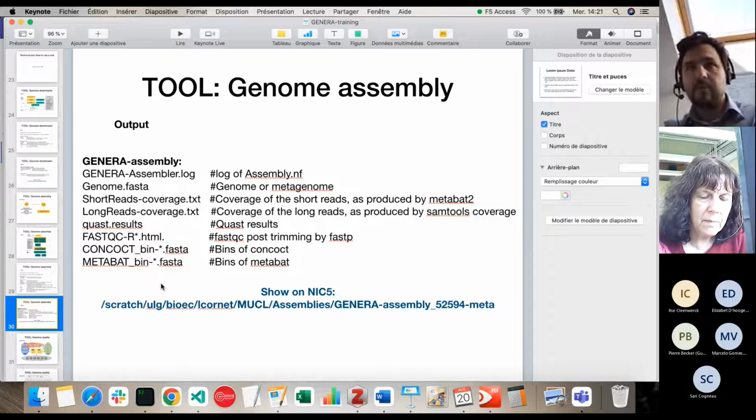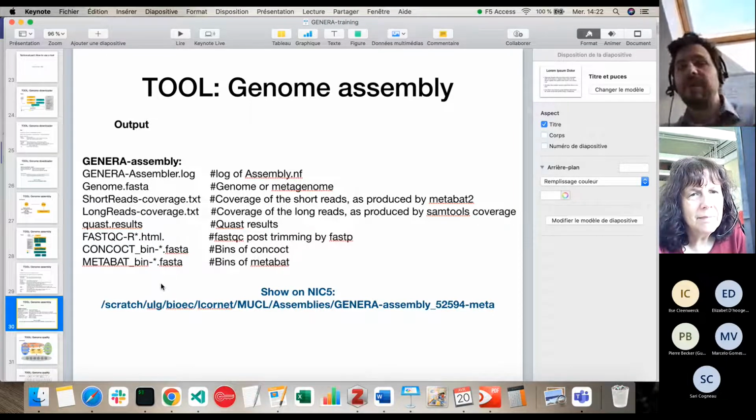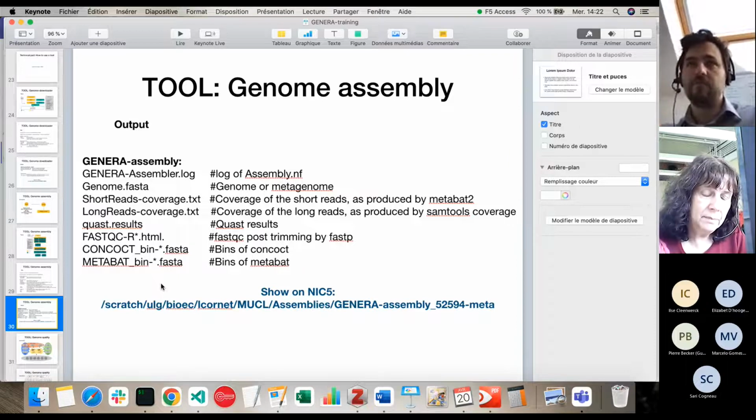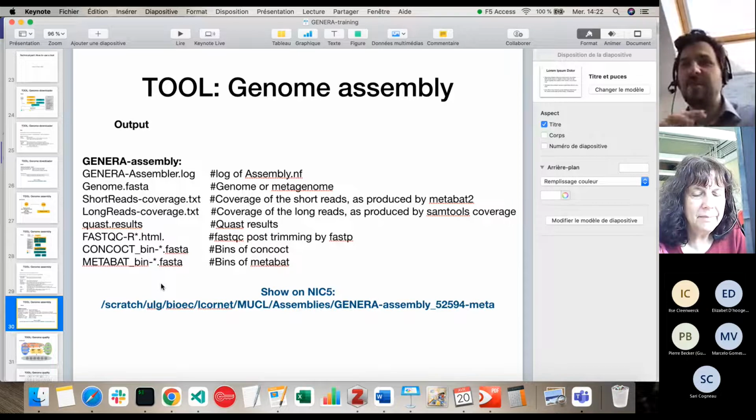But yes, you have to be sure that this genome is good, because nothing in your genome assembly will be modified except according to this option. So you will not incorporate genomic contamination or assembly errors, because you simply order the contigs. If you have a good reference genome, for example, if you work on a plant and you want to order according to Arabidopsis or something like that, that would be perfect. Or if you have a good cyanobacteria, I don't know, maybe Acaryochloris or something like that, that would be fine. But you have to look at this.